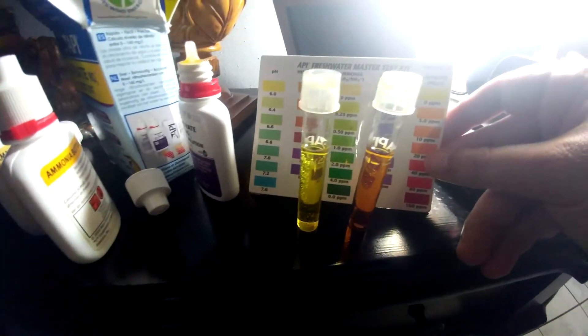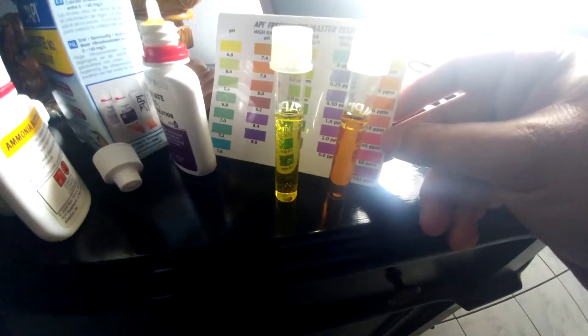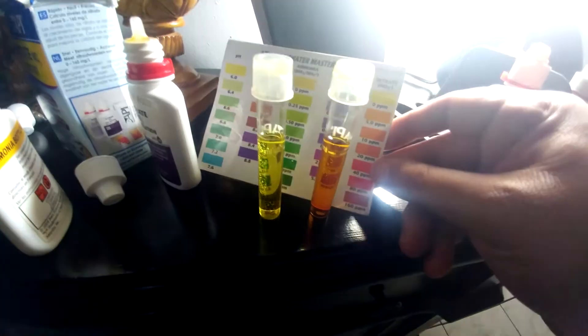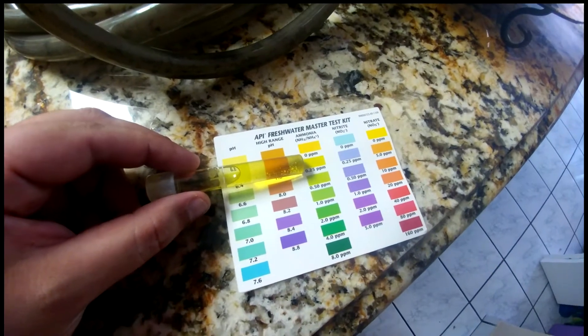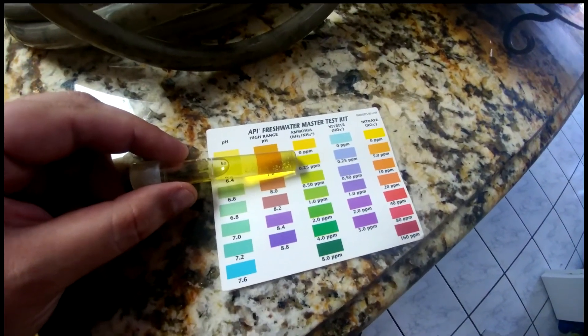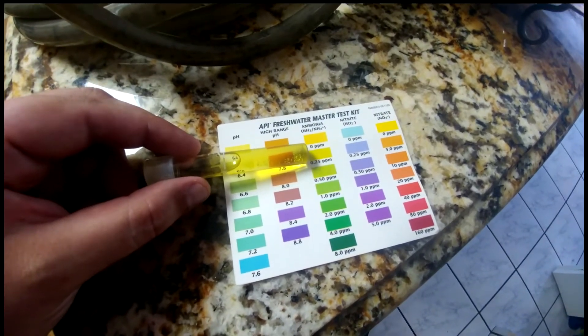You compare it to the chart here. As you can see, the ammonia is yellow, so that means we have zero parts per million. And the nitrate that looked yellow before — you can see how it's getting a more orange color, so we're actually going to let that sit for a couple more minutes and then I'll show you what it actually is.